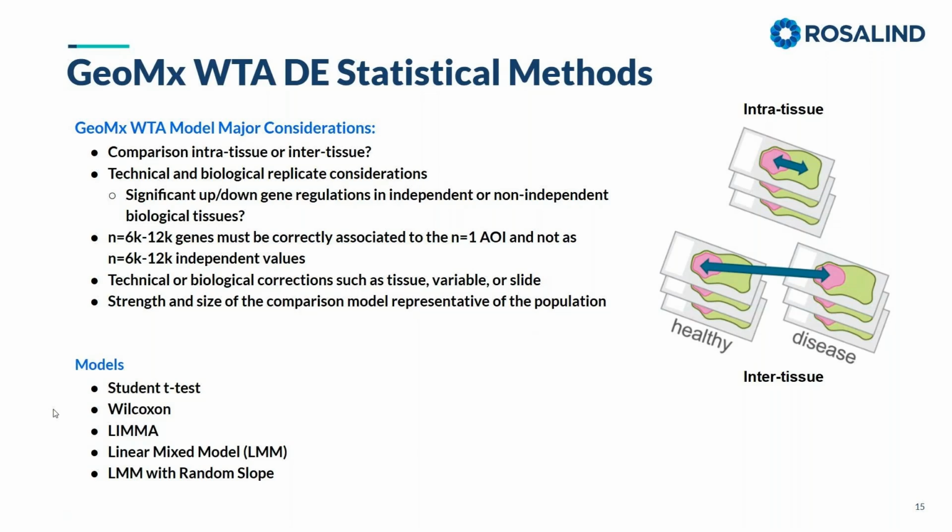So you can already start to see how the spatial can be really complex. And if you start to dissociate and make these all independent values, you can easily start to have misrepresented results. Let's say you had 80 AOIs. They're actually from 3 different tissues, but now your model looks like it has N equals 80 instead of N equals 3 different tissues. So that's how this can easily get out of hand and misrepresent the strength of your data.